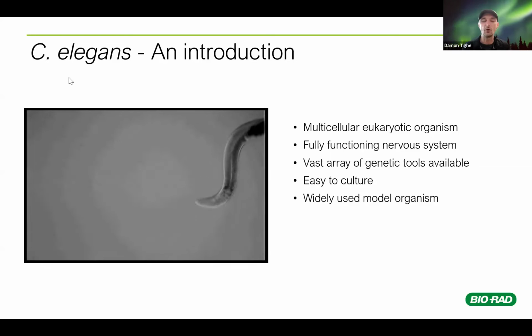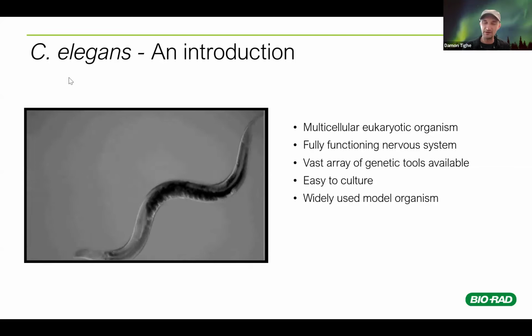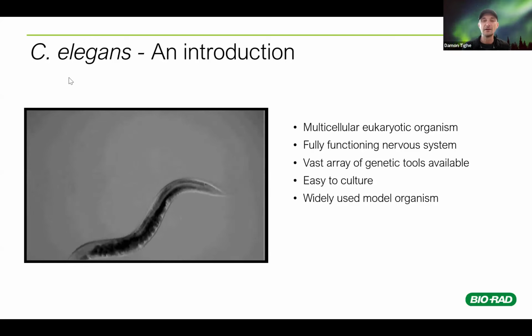They're super easy to culture. So if you've ever been able to culture E. coli in your classroom, you'll be able to culture C. elegans. Mainly because we're going to feed them on E. coli to make them really easy to work with.